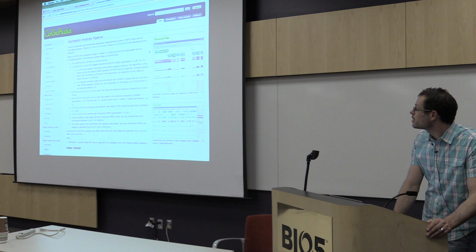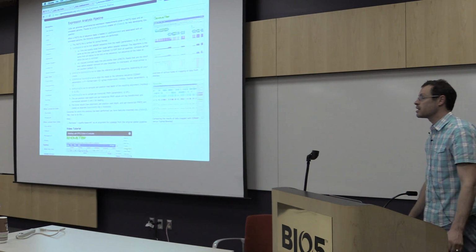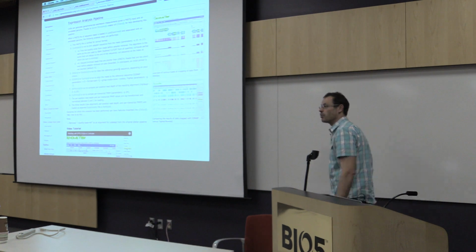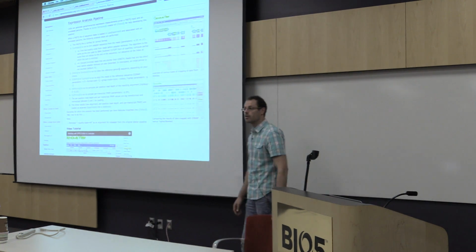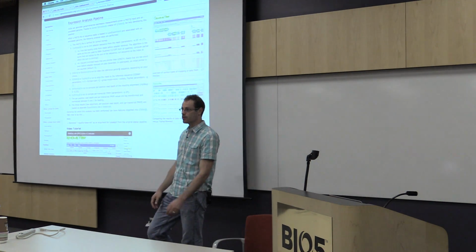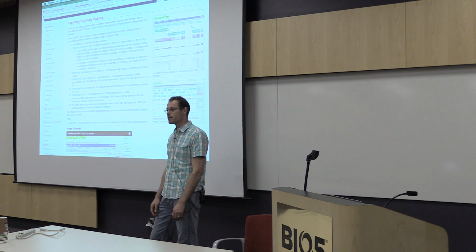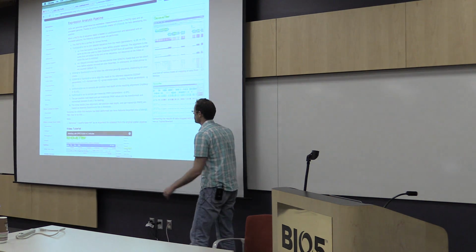And if you click on this, it'll go ahead and give you a breakdown of everything that it's going to do to your data sets. We try to make it one-click simple. This is not going to be perfect. It's not going to be as good as what a handcrafted expert can produce for you. But you know, sometimes you just shop at Target because it does what you need it to do. Gets you most of the way there.